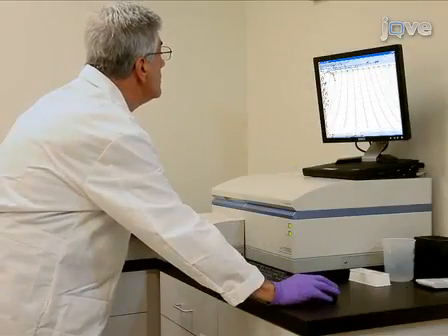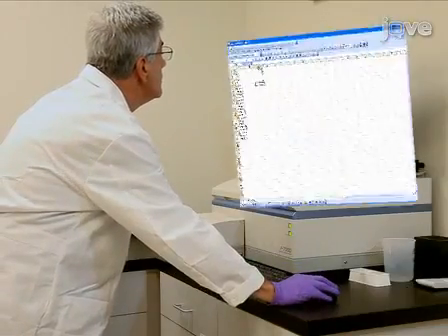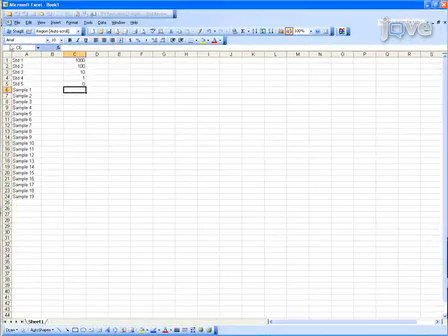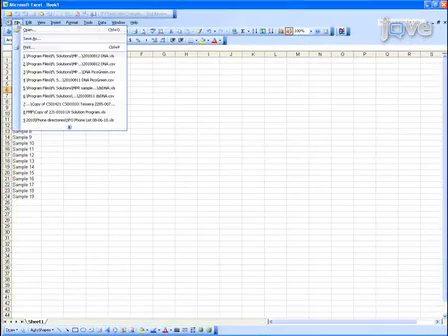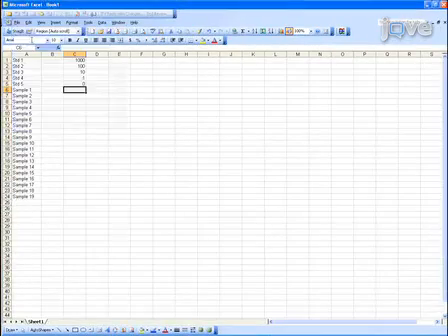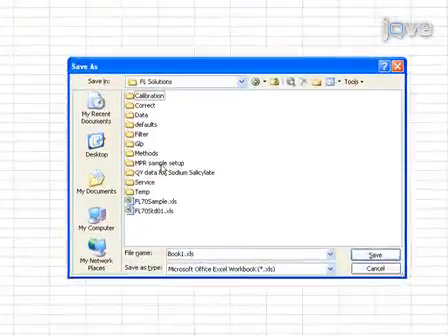In Excel, create a file with the standards and sample data and save it in comma-separated values or CSV format.